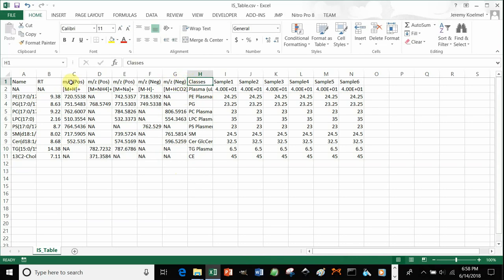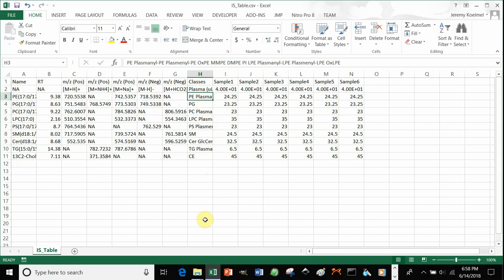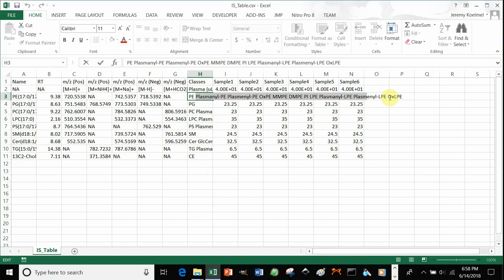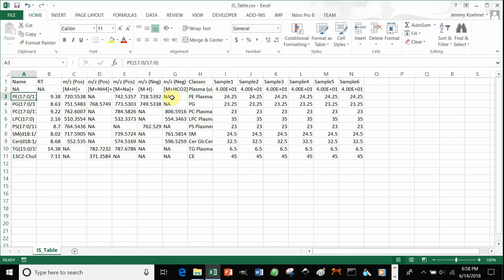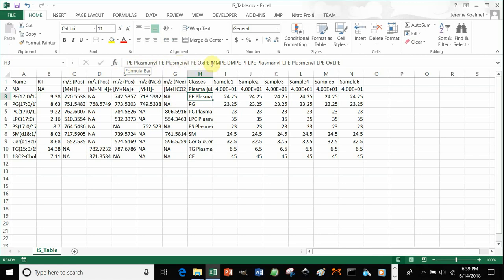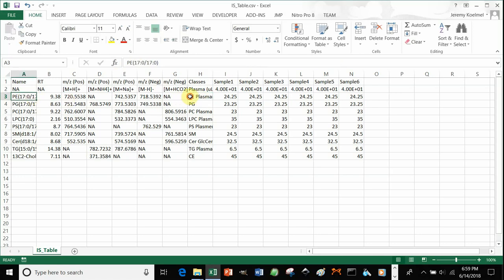After you fill out all your adducts, which should all be adjacent to each other, the next column right after the adducts should be a 'classes' column. In the third row and down, for each internal standard, you type in the acronyms or names of those lipid classes as they would appear in your feature table. For example, PE-17:0/17:0 is our internal standard. If we have PE, plasmalogen PE, ox-PE, monomethyl, dimethyl, phosphatidylinositol, lyso-PE, etc. — all of these different classes, if found, would use the PE internal standard to normalize those.